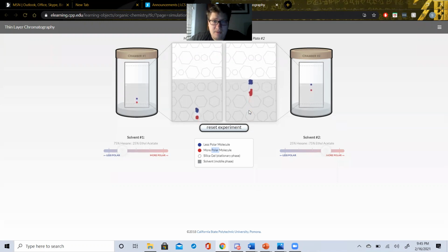So you have to wait for the entire experiment to run. It is a good thing this isn't a done in-class lab. It does take forever, and TLC plates are notoriously hard to do. So it is a good thing we're doing this lab online.